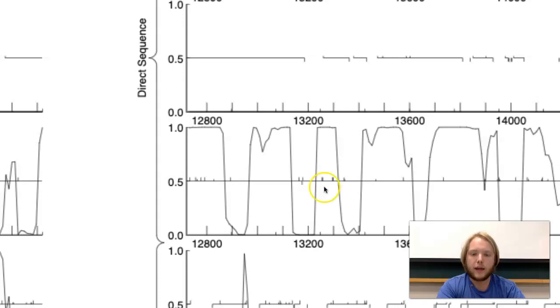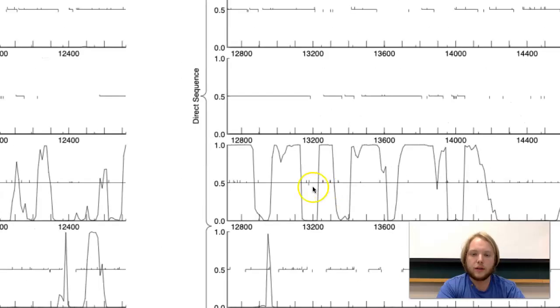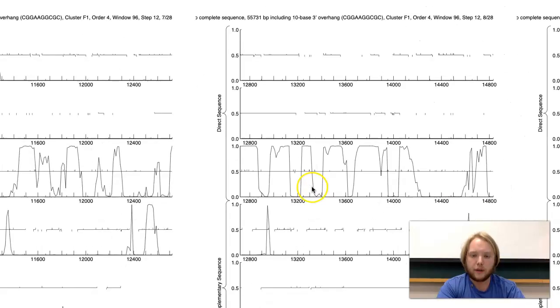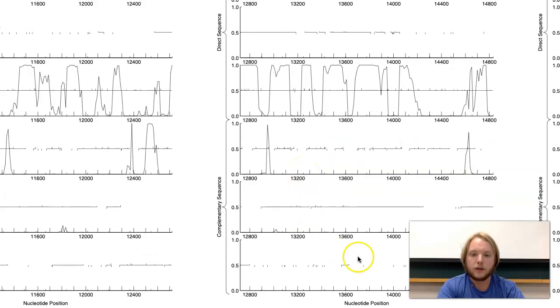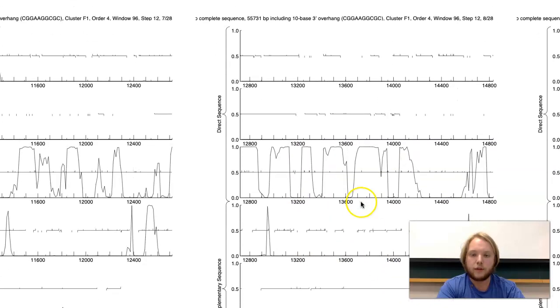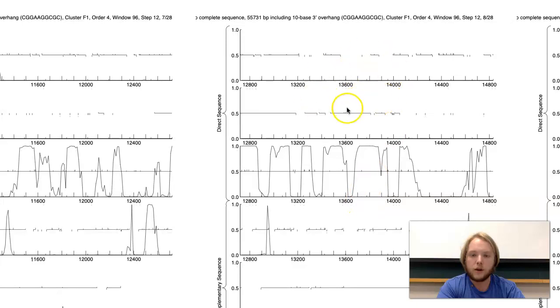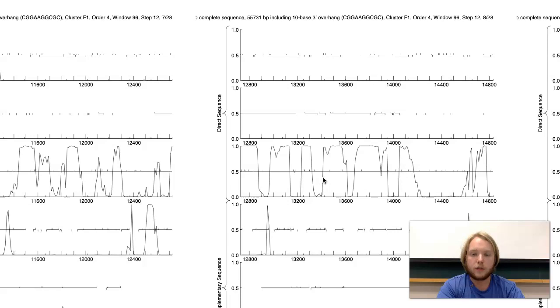Let me show you why it can't be the others. If you zoom out here, this next gene contains all of this coding potential, all of these spikes, whereas none of the other frames do. Because of that, this is a fairly obvious pick. However, there are some cases where it's a little tougher to decide where the gene is.